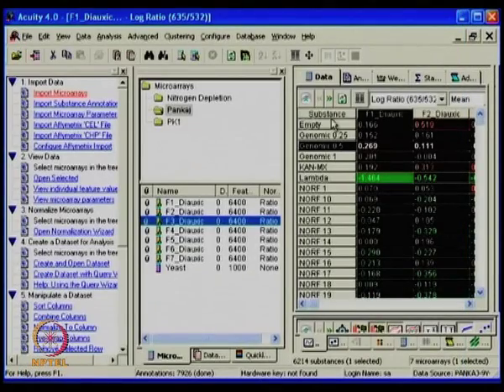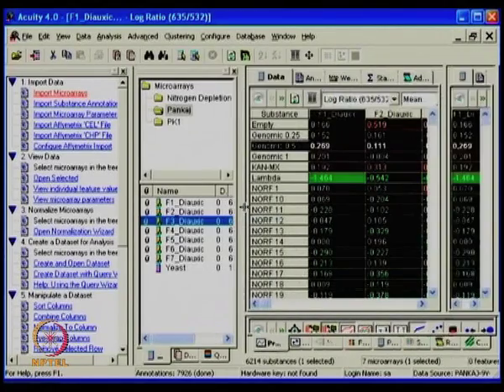Once you have all the data normalized after the import, and you have the annotation and the parameter file ready for you, there are a few ways with which you can look at the data. Before moving forward, it's important to ensure that normalization was done properly, and one needs to look at each slide carefully. As we discussed earlier, it's very essential to have the same normalization process done for all. It is not a thumb rule which one is more preferable. One can choose anything, but make sure all your different slides are handled in a similar way.